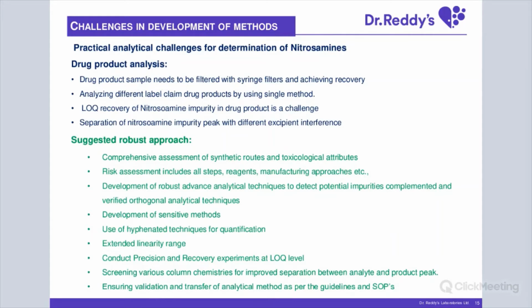And as I mentioned, it is important once we develop the LOQ in future, the 100% of the LOQ target should be 0.01 ppm. And once we establish the LOQ, I think it is important to make sure that precision and recovery and accuracy at LOQ is established very well.